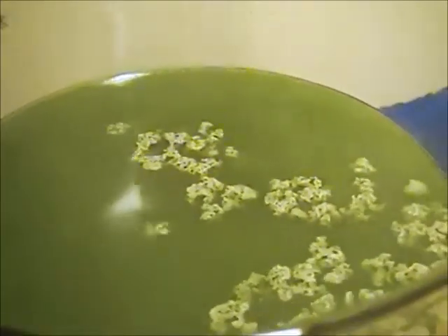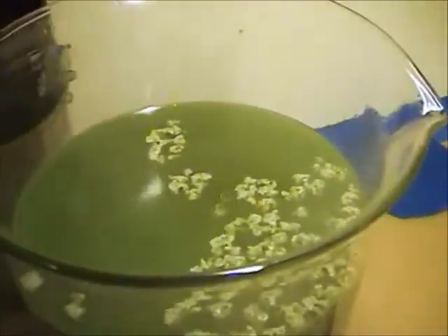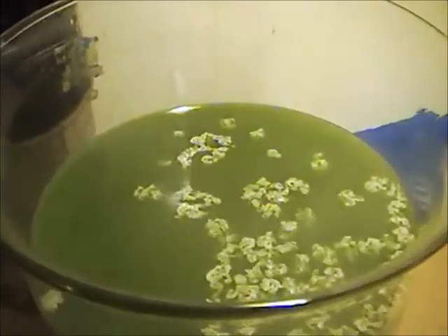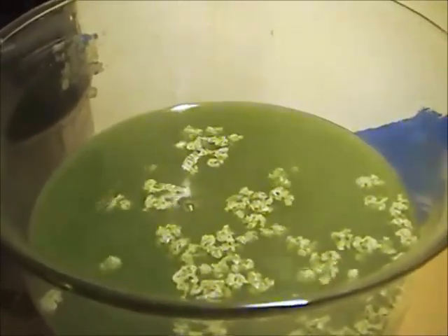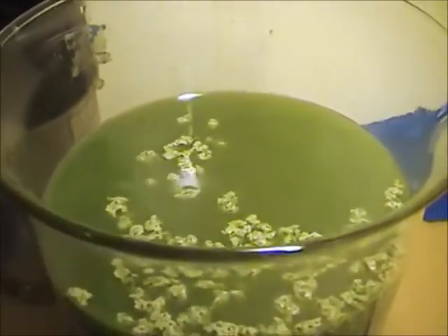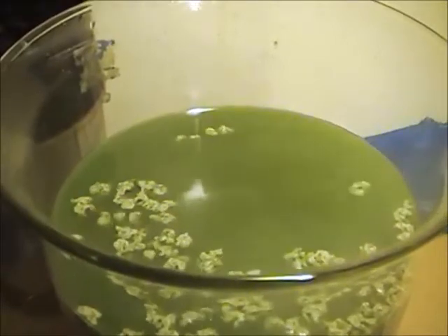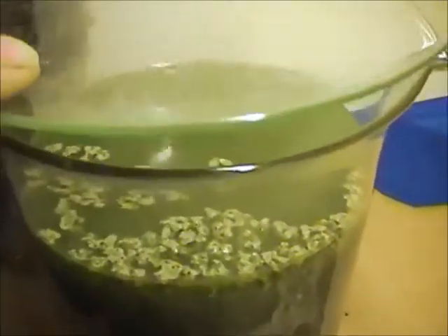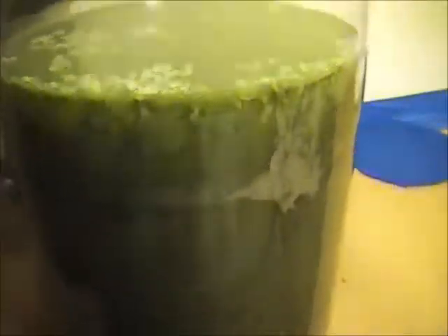What happened is I added too much, and it kept going back in the solution, which you'll see here in a minute. So I just decided to over add. It seems that we've got a continuous gas coming from this solution, and that's what's causing the silver to rise and fall. But once that finishes, this should all sink to the bottom, and I'm pretty much sure that everything is precipitated from that solution by now, but we're going to test it just to make sure.